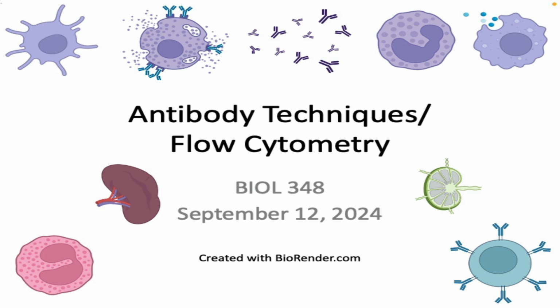I'm going to talk about some general antibody techniques and then use that to segue into flow cytometry. I like this in this part of the class for 2 reasons. One, because we're talking about antibodies in class, and so thinking about techniques that involve antibodies makes sense. But also because when we start talking more about B-cell biology in the future, a lot of parts of B-cell biology are things that I need flow cytometry to explain to you fully.